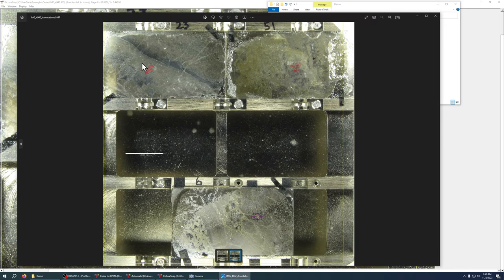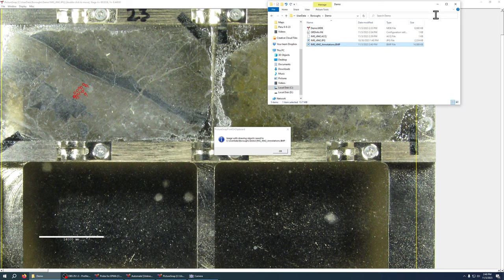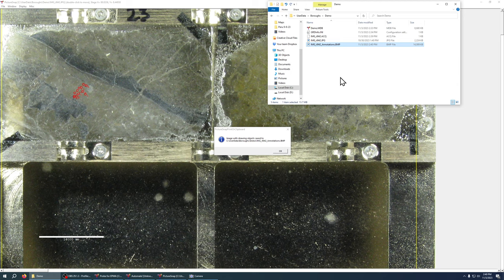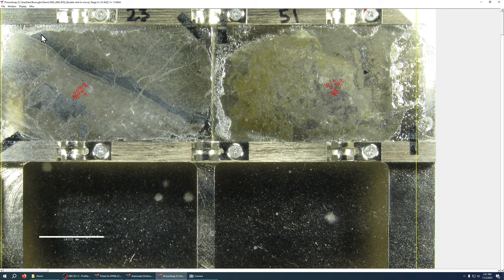So this is great for record keeping in order to maintain that spatial information for your analysis. Okay, hope that helps you working with picture snap.